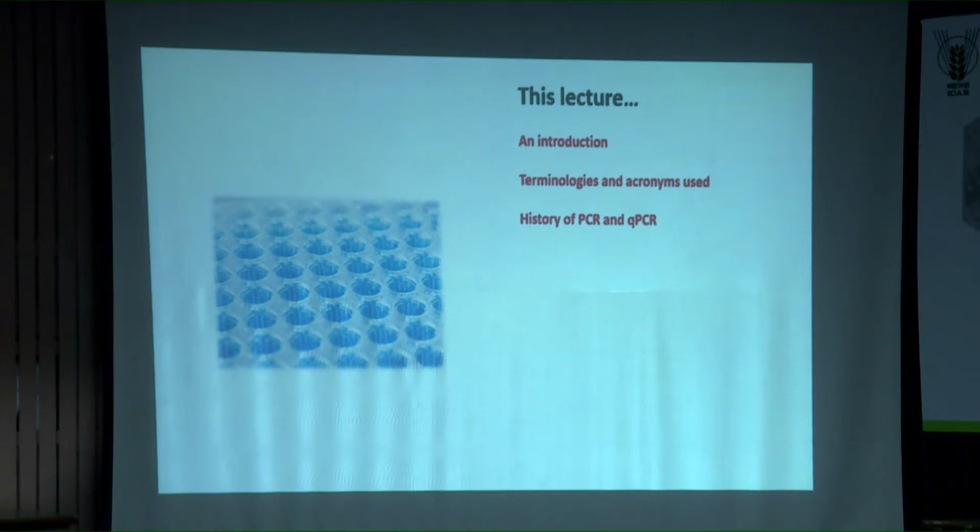And history of PCR and qPCR, let us take a couple of slides on that. What prompted the scientists to invent something like qPCR, a little bit of historical account on that, and the major differences between PCR and qPCR. So all of you must know what are all the fundamental differences, if any. And of course, when you talk about qPCR, the results are visualized, and the technology associated with the visualization of this qPCR is so important for us.